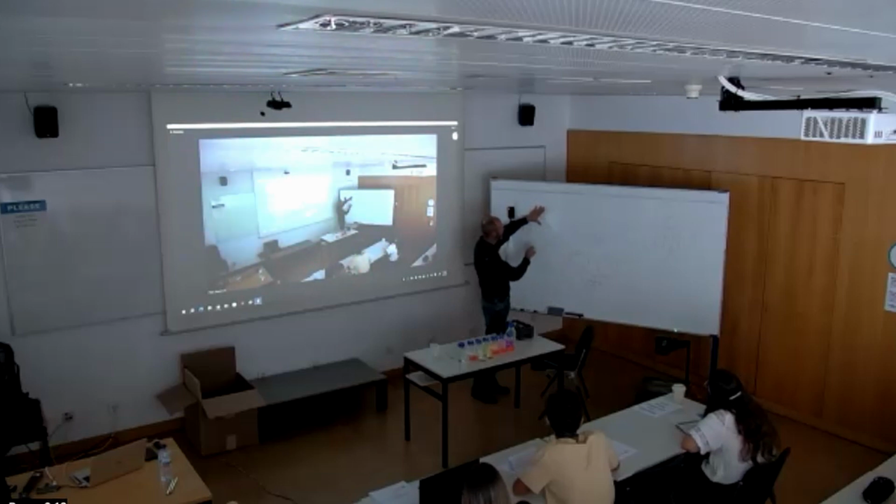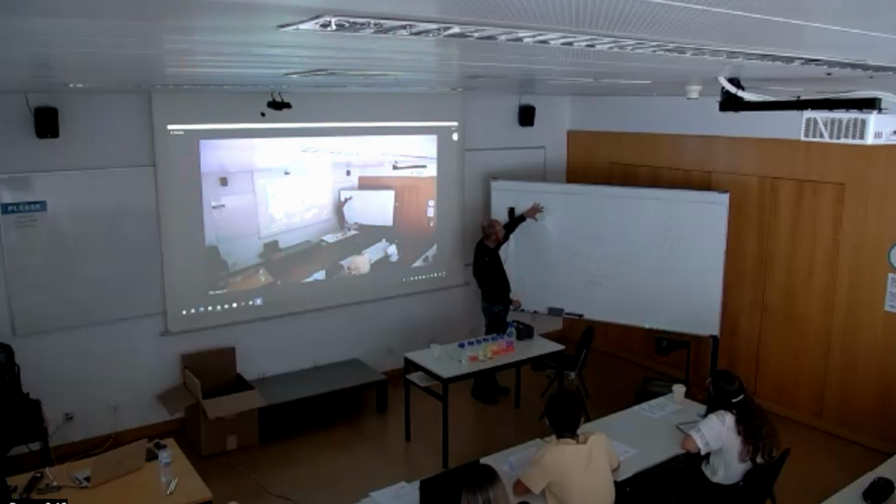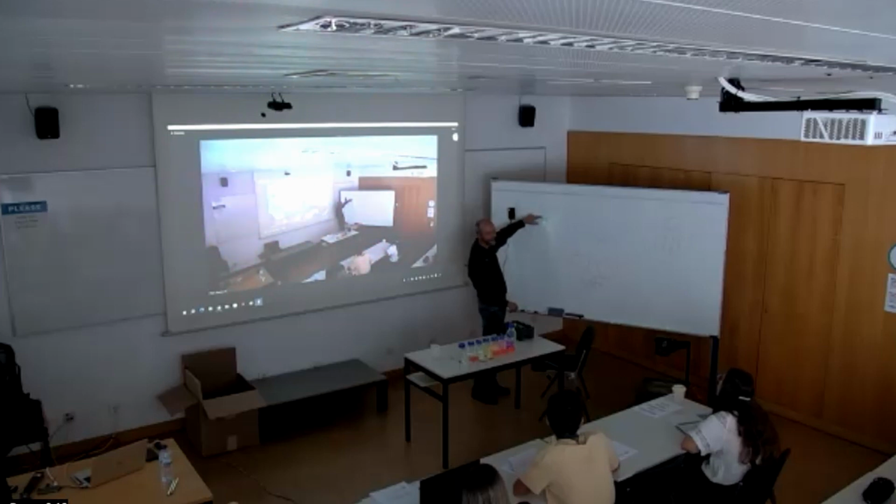You see this? Okay. And then the more I increase this angle here, the more it bends outwards. You see? It's bending more and more and more until it travels parallel, which is called critical angle. And after this critical angle, then it totally internally reflects and comes back. Okay. So I will show you again.